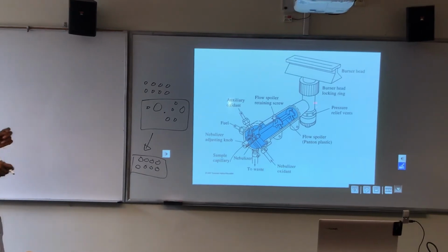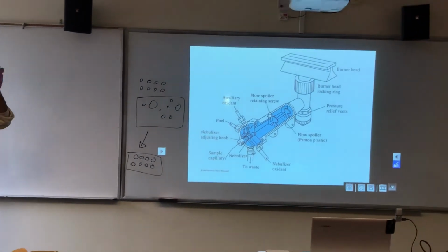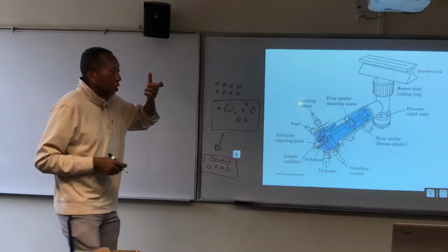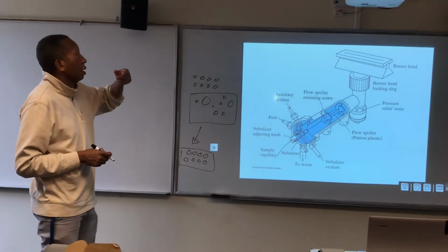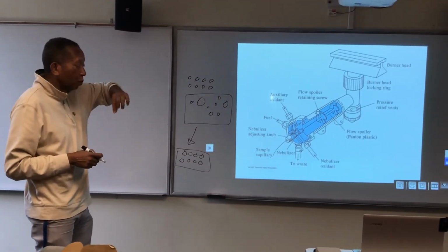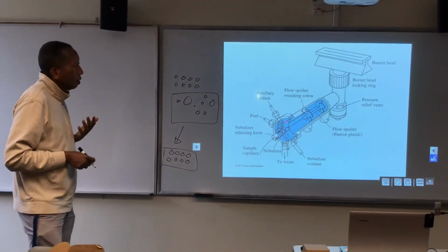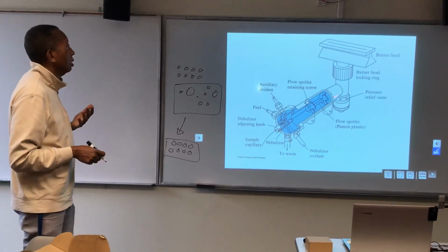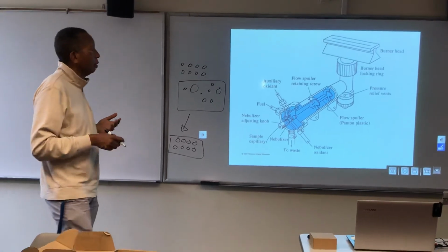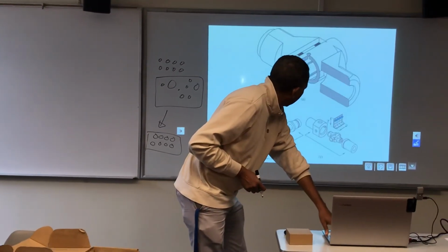Think of it at this point, when we say it's uniform, like the cuvette. When you have the sample in the cuvette, the concentration of the analyte in there is constant. If you pull the cuvette up a little bit and take the measurement, it's the same. Here, the measurement won't be uniform, but here we have a uniform sample of those particles. So that brings us back.